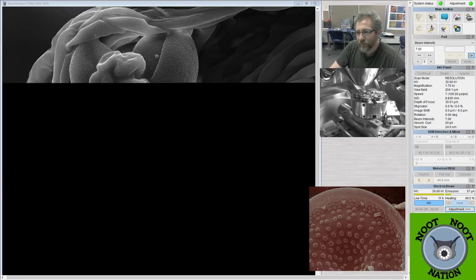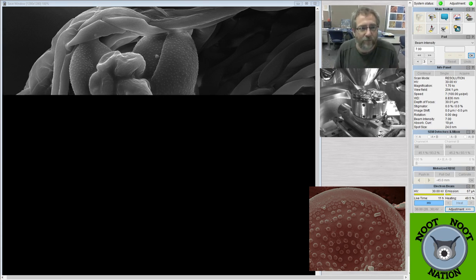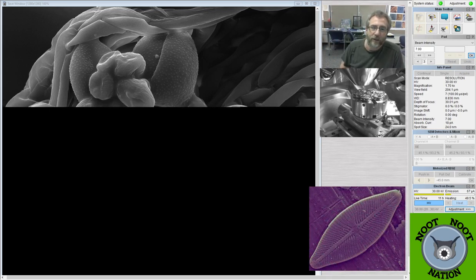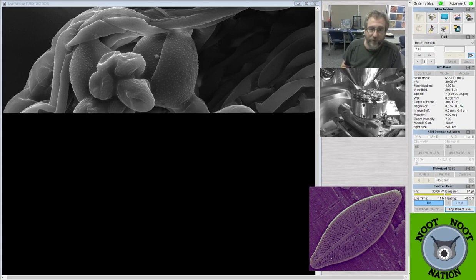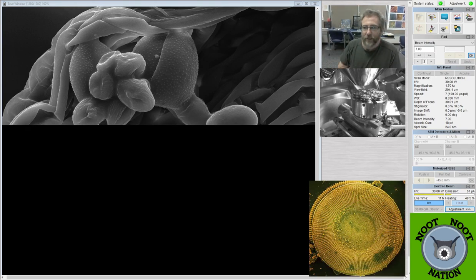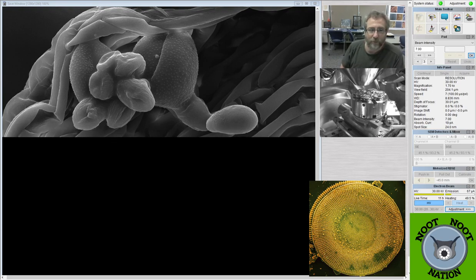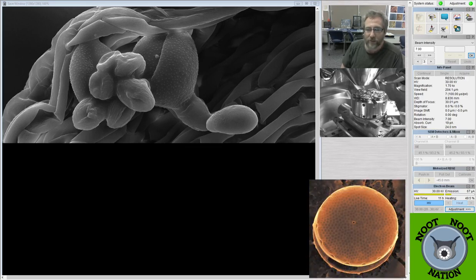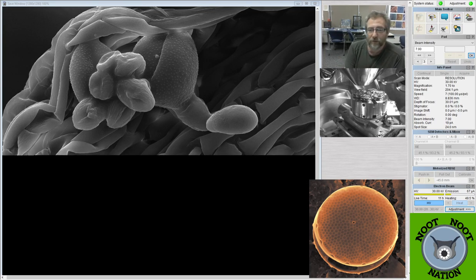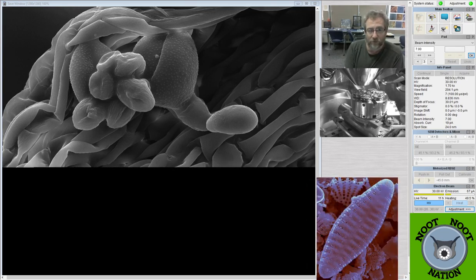Would you ever use the SEM for looking at living microorganisms, or is the refresh rate too low for something like that? For that, everything that happens in the SEM occurs in a vacuum. So this chamber that you see below me is a vacuum chamber. That's because the electrons are being fired from a gun at the top of the chamber down through that pole piece you're seeing, the little cone. And living things, I mean, we're looking at things that were living an hour ago, but moving things aren't going to be able to live in there. There is an environmental mode for my SEM, which runs at a low vacuum. This is a high vacuum mode we're in, but it will run in low vac mode.